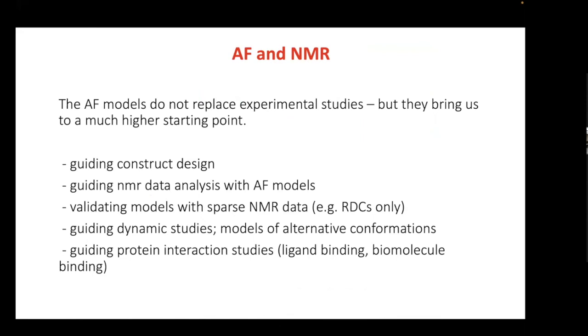So, AlphaFold and NMR. AlphaFold models do not replace experimental structures, but they bring us to a much higher starting point for our experimental studies. They can be used for guiding construct design, guiding NMR data analysis with AlphaFold models, like I just described with the problem with all those precision violations, validating models with sparse NMR data.